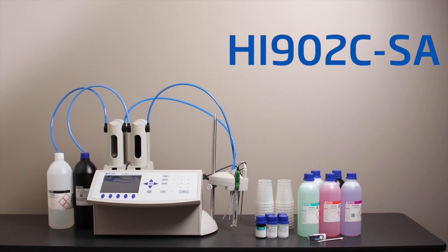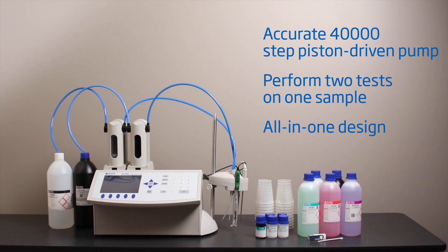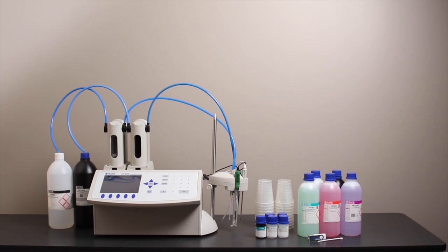Salt and acidity analysis is easy with the Hanna Instruments HI902 Automatic Titrator. In this method, a single sample is titrated automatically for both titratable acidity and salt. Once complete, the titrator displays both values on the screen. In this video, we will demonstrate the salt and titratable acidity of ketchup.